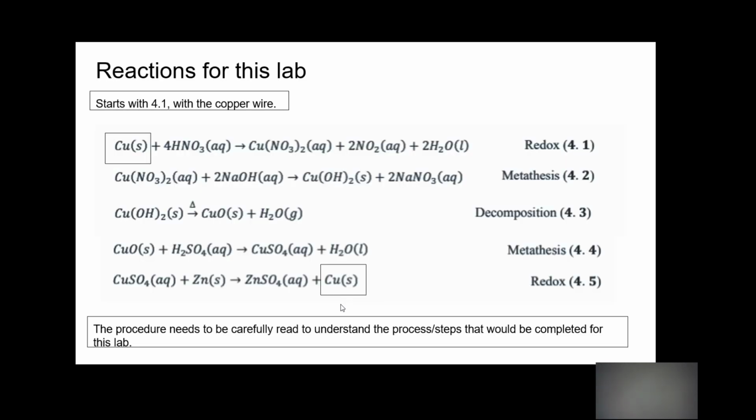So I pulled up the reactions. These are very important reactions, and you're going to need to thoroughly understand them. I strongly suggest, if you don't print out the PDF, then take a picture of this, write it down, or copy it. It's definitely going to be asked about, over several steps.